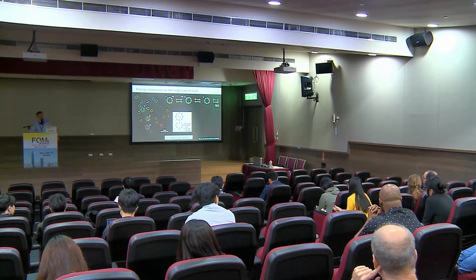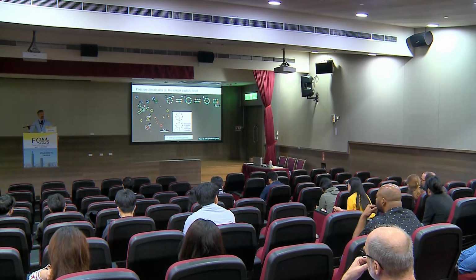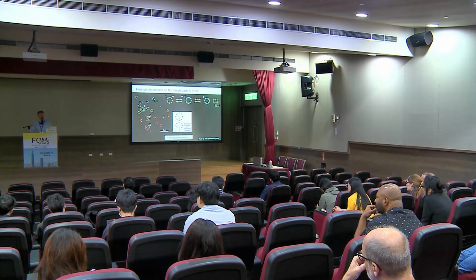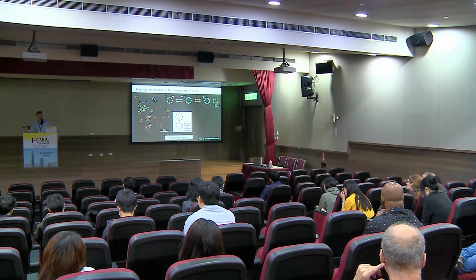What about the damping effects in the MINFLUX tracking sequence? On the commercial microscope, they suggest to use a certain damping, but I don't know if you have an opinion about which is the optimal damping with respect to the diffusion you are analyzing. I think they recommended using a damping, then recommended not using one. What we saw in our simulations, we really looked at this, is that there's hardly any effect if you use a damping of 0, 1, or 2. So in the end, it seems to not matter much for the diffusion.